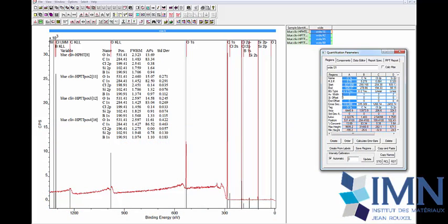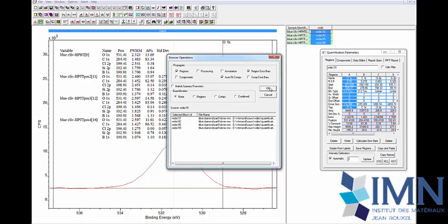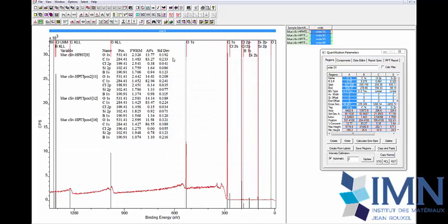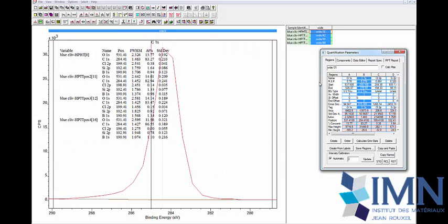And there is also another advantage when we use this. You can play, for example, with the average, the average of your left and right background limit determination, to reduce your uncertainties. You have to do it in a reasonable way. Sometimes you win, sometimes you don't win, but now we have reduced the uncertainty error on oxygen. It means that, by the fact that everything is correlated, uncertainty on one element will induce uncertainty on the other one, and this will improve the general uncertainties.